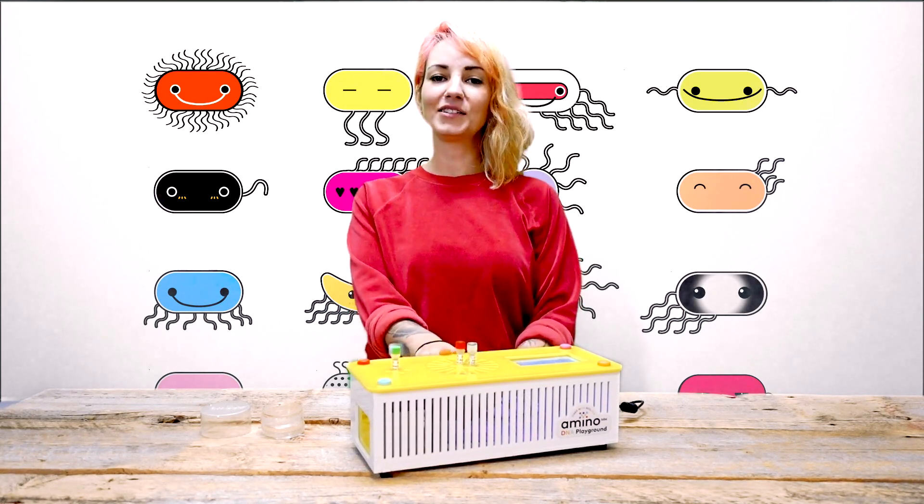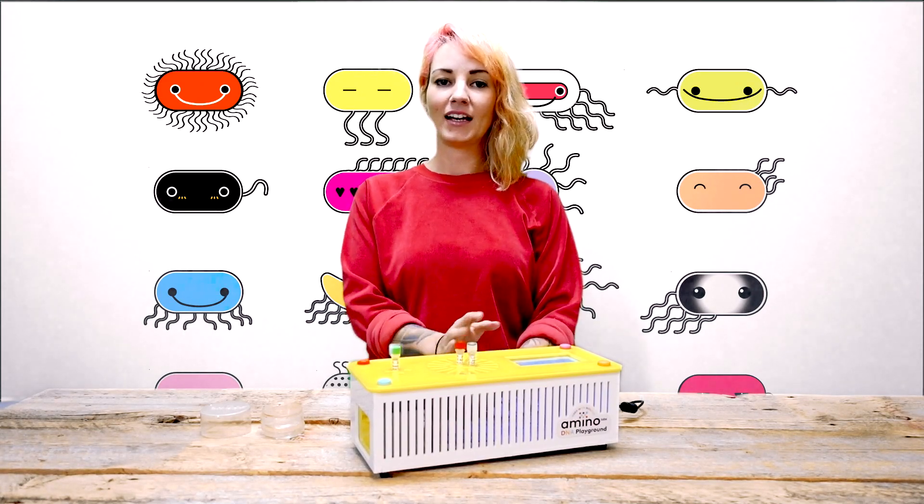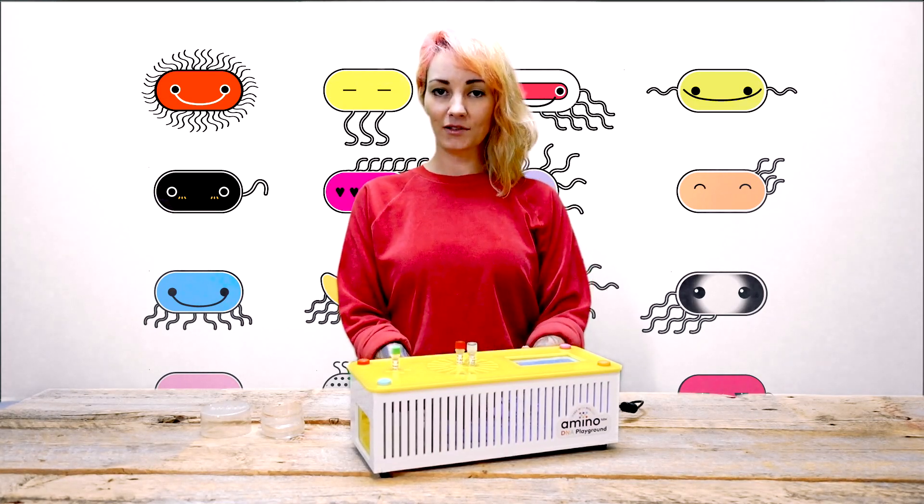The DNA Playground is an exciting new type of lab equipment that makes learning science fun and easy. It allows you to grow an engineered living organism at home, at school, or in the makerspace.